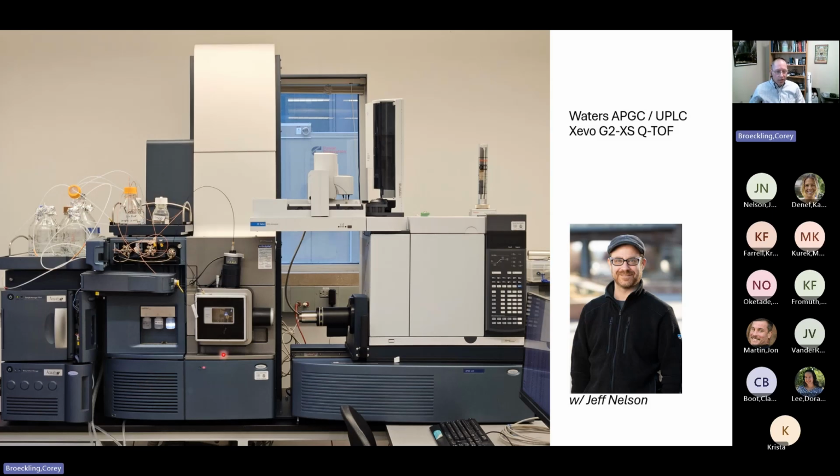And we can actually change the ionization source here so that it either supports coupling to the GC system or the LC system. And we have options as to which we choose. We can switch back and forth relatively easily. I'm going to talk today primarily about its functionality as a gas chromatography quadrupole time of flight system. And Jeff Nelson, who is pictured here on the right, is one of the employees at ARC that really helps to move services on this instrument forward.